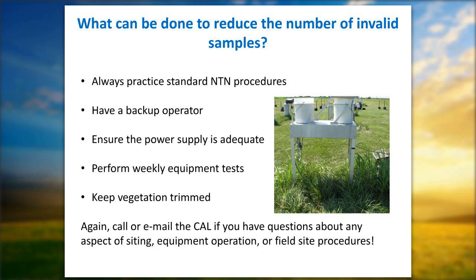These bottles are cleaned and reused, so any sort of residual that you may get from wrapping tape around that can introduce itself as a future contaminant in the bottle itself. So please don't use any tape in trying to tape the bottle shut. Yeah, we found the tape. That was one of the things we tried. We tried tapes and bands.